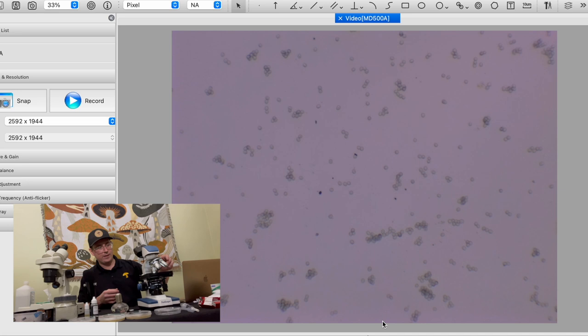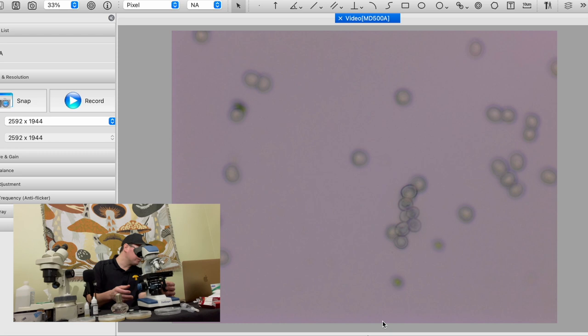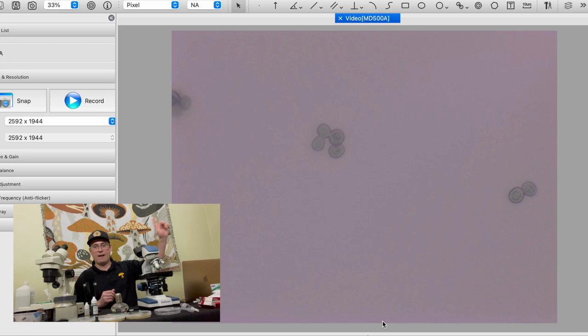I can go a step further and do my 40x — wow, we've really got some cool resolution here. It looks like there are some viable spores on that print. And if you want to watch the video I made about isolating a single spore using a pipette tip, this is a perfect stage to grab your pipette tip and a blank petri dish and collect haploid spores manually. It's a little tricky — a very delicate procedure — but definitely check that video out if you're interested in breeding.